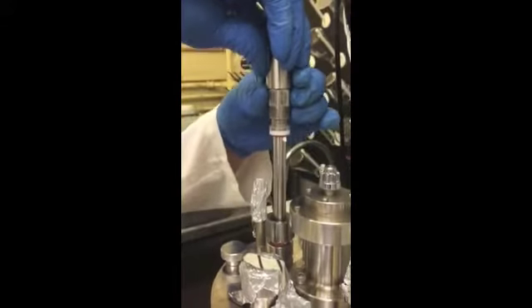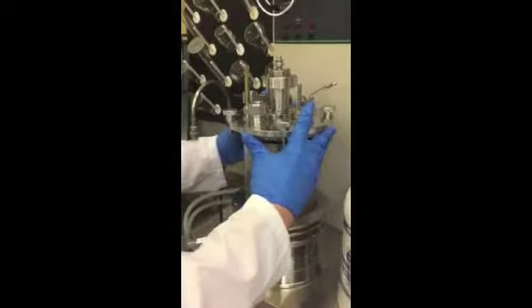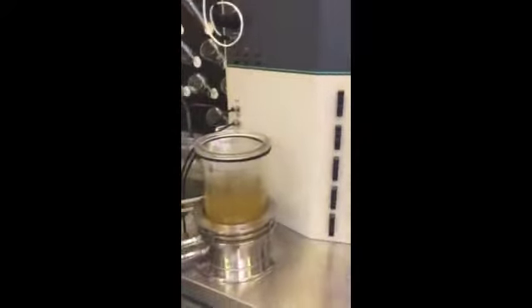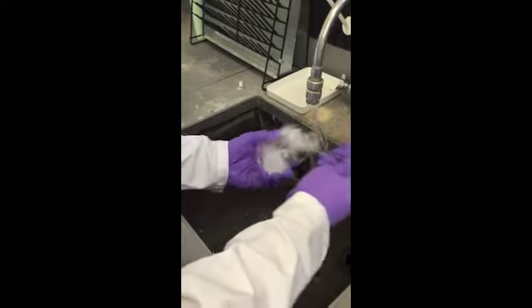Remove both the pH and DO probes and spray down with ethanol. Place all bioreactor parts and other glassware used in this experiment into a basin containing detergent. Pour detergent into the bioreactor in order to kill the E. coli. Be sure to wash all other glassware and equipment used.